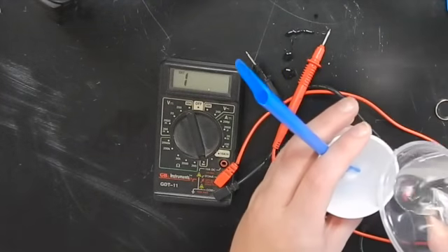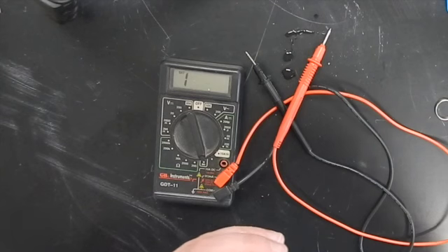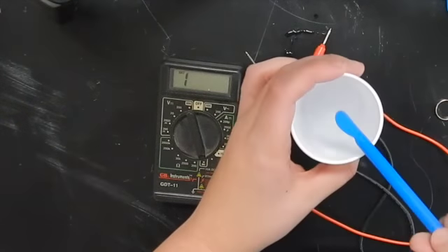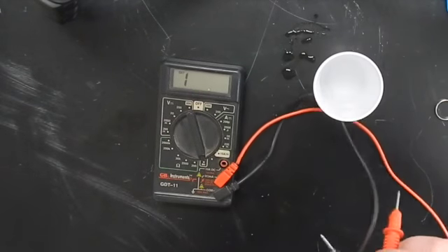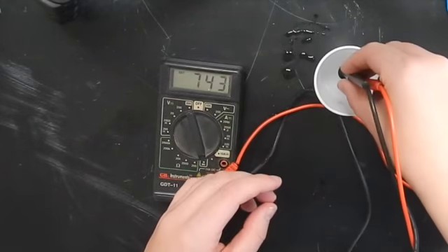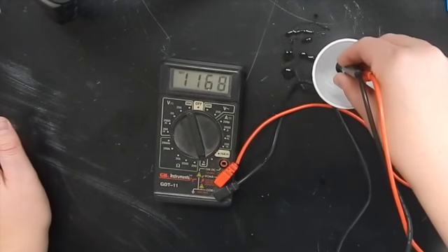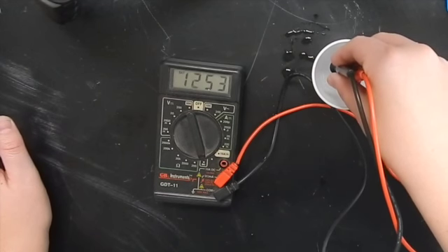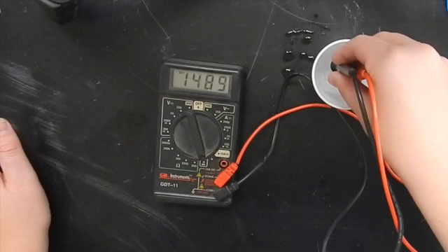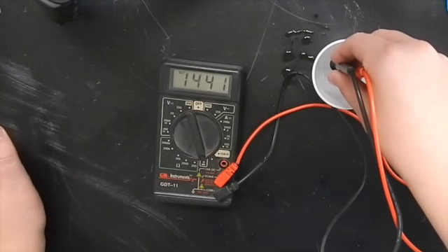Unknown number 2. Putting some water in there. So it's conducting a little bit. It's not nearly as high as the others. So use that information to help you conclude what you should put in the blank for unknown number 2.